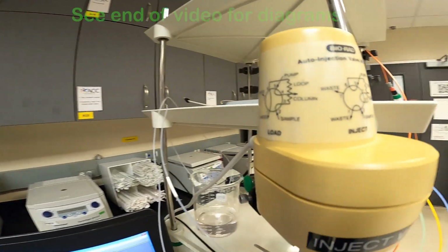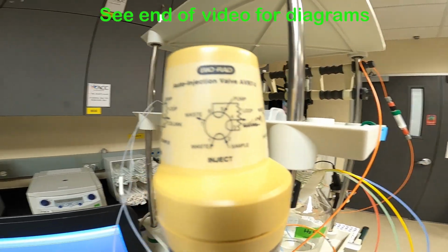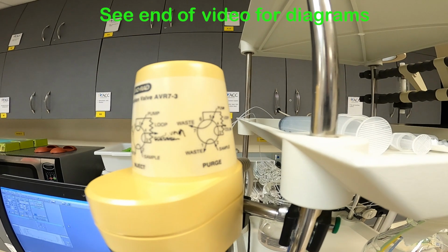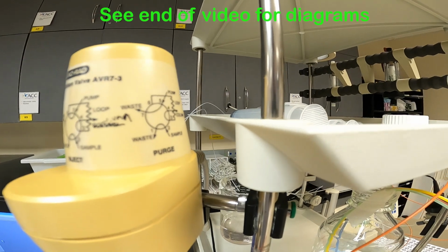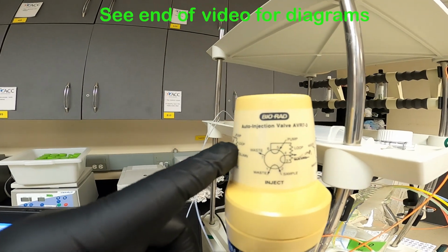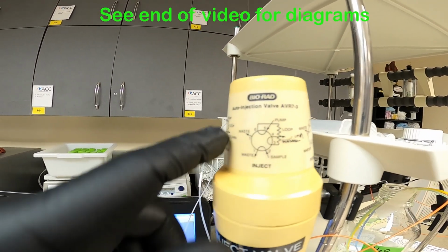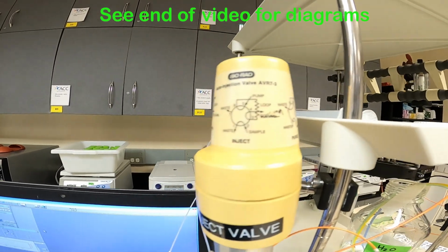And here you can see a diagram of the different positions. I would recommend looking at these diagrams closely if you want to get a better sense of how the system operates, because it's basically flowing in from our mobile phases and out at our fraction collector. But how it makes its way through the rest of the system can be determined by looking at these diagrams, and specifically look at port 5, the pump, because in each one of the positions, the pump is being diverted in a different way. So take a look at those, and it'll help you get a better understanding.